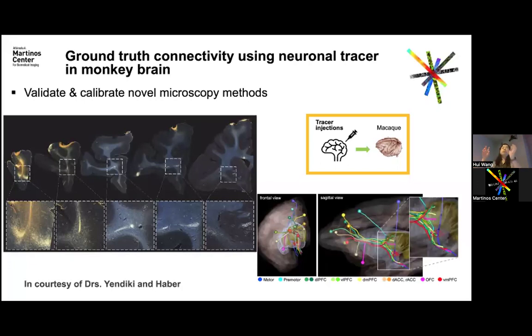The slices go to traditional histology, and that can be cleared, scanned, and then cross-validated.